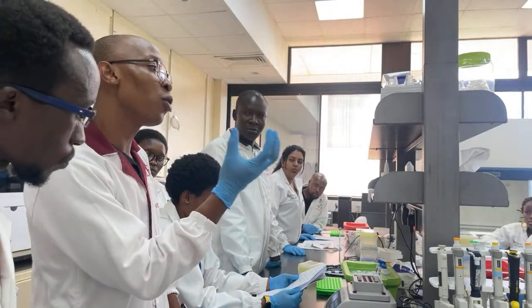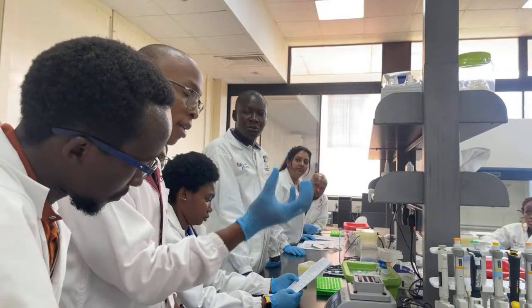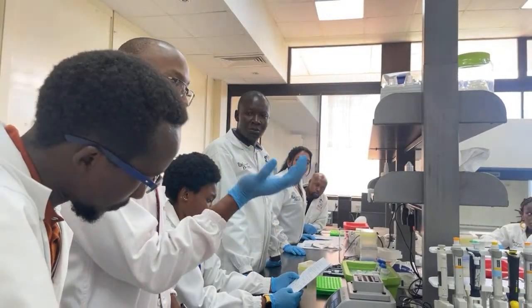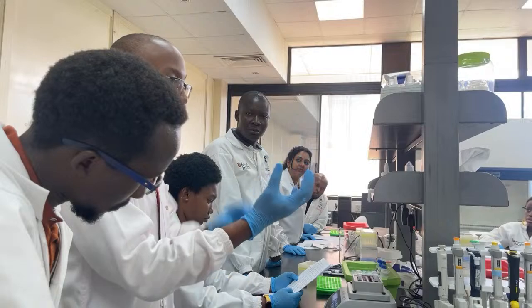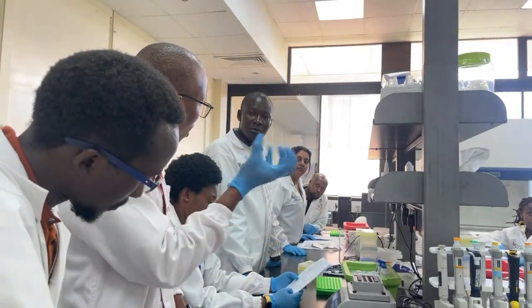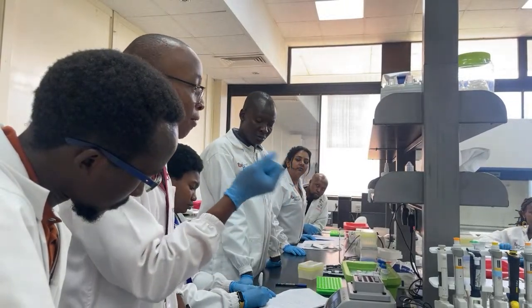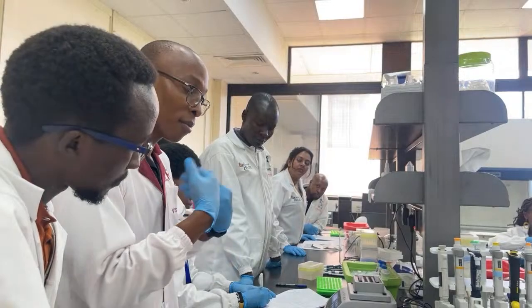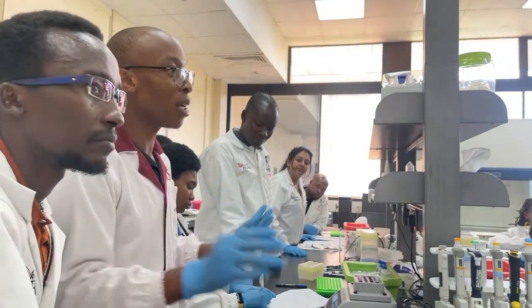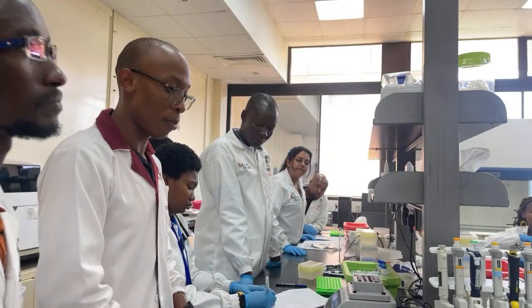So the overnight step is to solubilize the DNA. When you see this cloudy, you leave it overnight so that it becomes clear. That's the whole purpose. You can't work with it as that clumpy because it's very viscous. So you need to let it sit overnight to solubilize and be a clear liquid that you can work with, pipette.